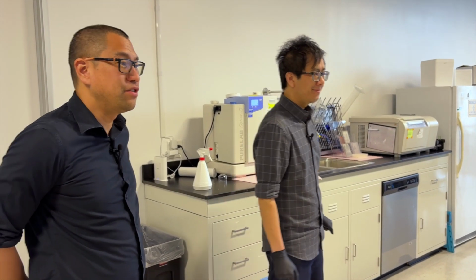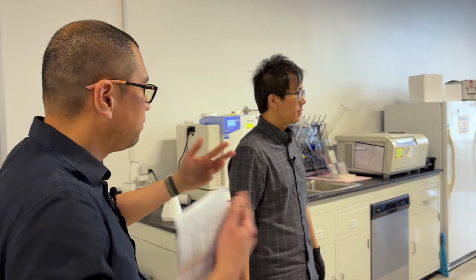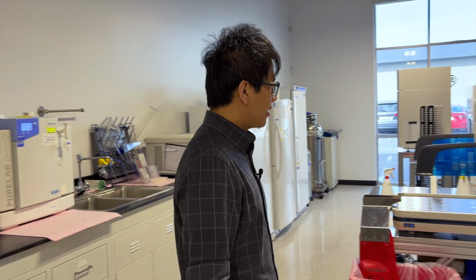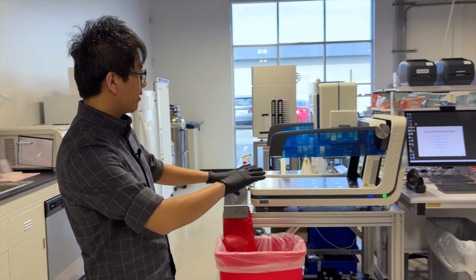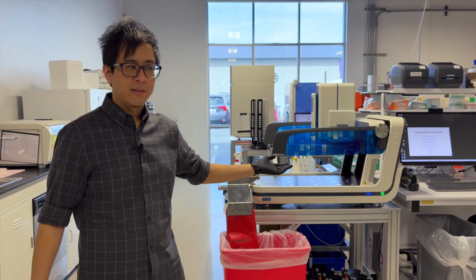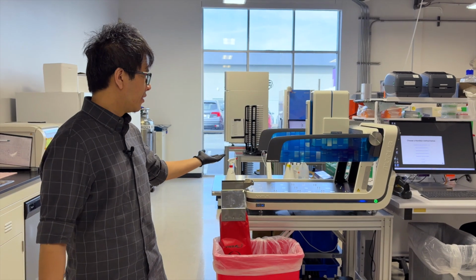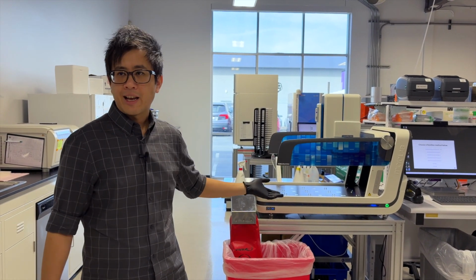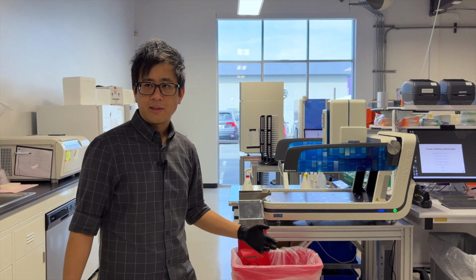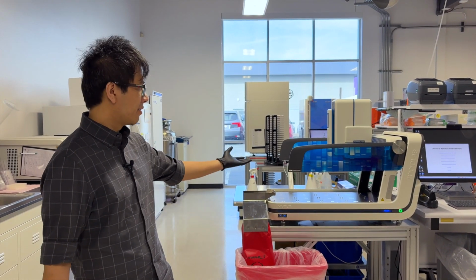Cool, yeah. So can you walk us through what the different homes are and maybe how it has evolved over time? Yeah, for sure. So in this area, you'll see our liquid handler. This is basically a 384 head. You can imagine it's the equivalent of 384 pipettes in one head that'll move around. It's very good for stamping. And so we use this for any sort of large scale stamping or creation of our plates. We do a lot of drugging, for example, and so we have to create these compound plates that have a bunch of different drugs at different concentrations. And this will help a lot with that.